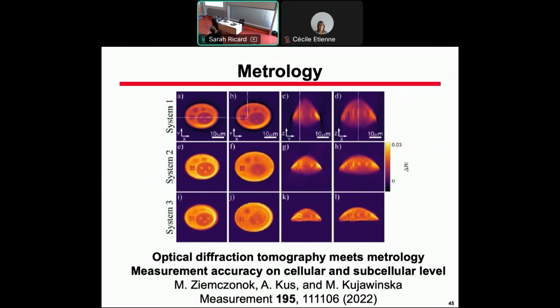The artificial cell is on the glass slide here. It's better than this. But if you look at the index, in fact, the constraint they apply to geometrically get back the correct shape translates into a lower contrast index of refraction.